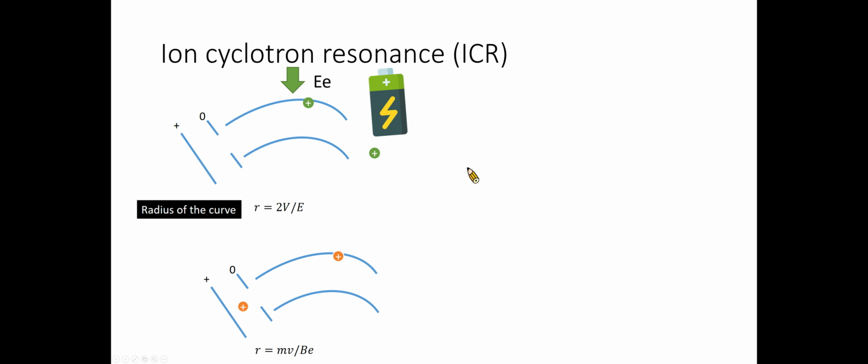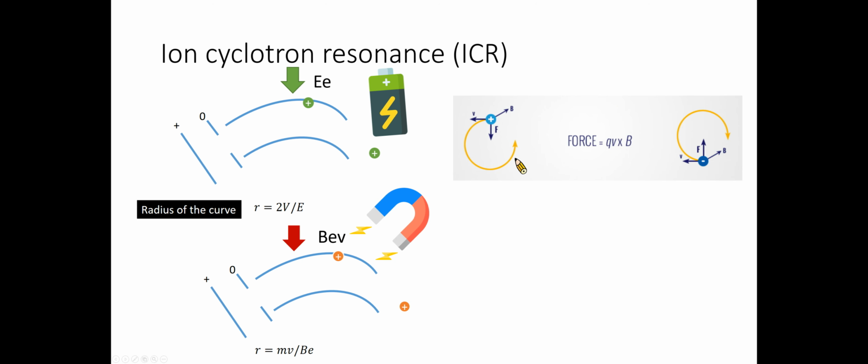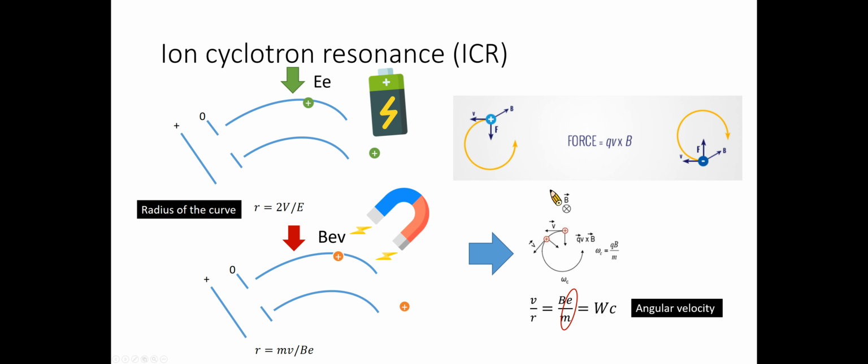Since the force exerted by the magnetic field is always perpendicular to the ion's velocity, it is perpetually turning the ion. The result is a circular orbit, with the ion circling around and around until another force acts on it. This phenomenon of circular ion trajectory in a static, uniform magnetic field has been coined cyclotron motion, and the frequency of rotation is termed cyclotron frequency.